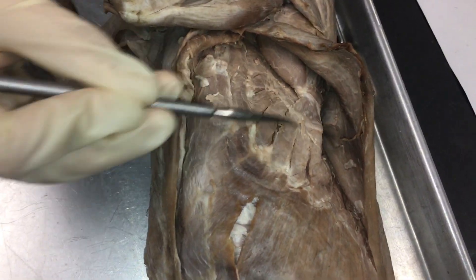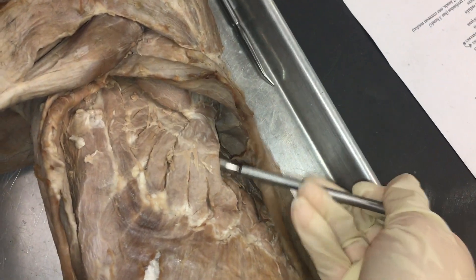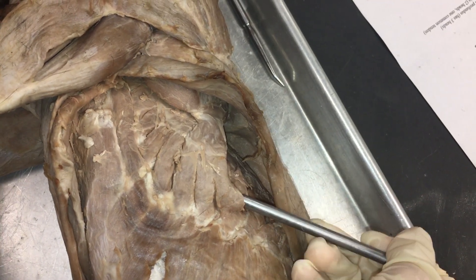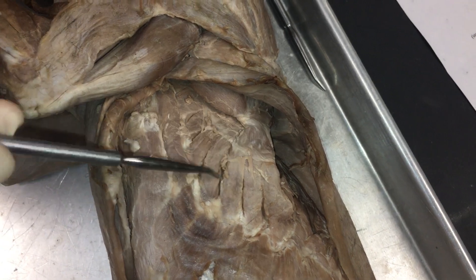We have serratus ventralis, which are these muscles right here. You can kind of separate them from the dorsal serratus muscles by this flap. So, this is serratus ventralis.